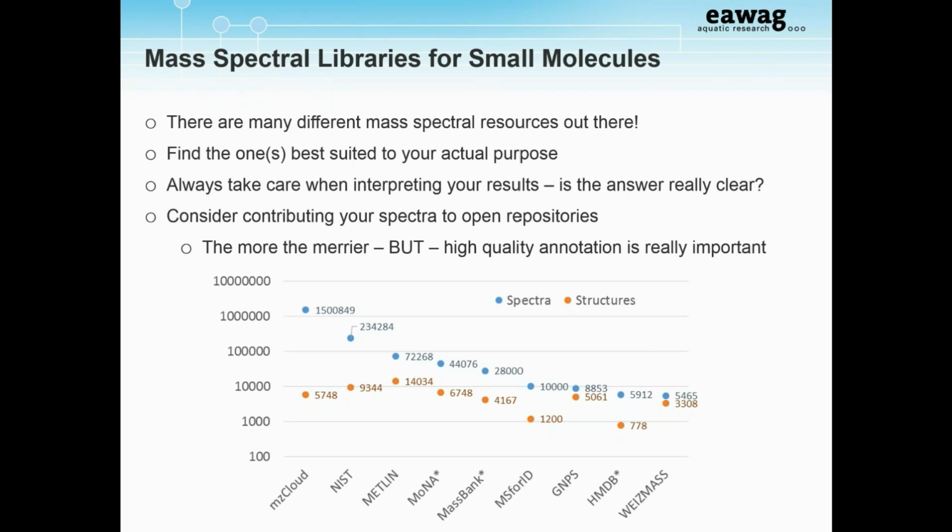The best way to do that is to put your thinking caps on and have a look at it. Just sitting back and having a look, so I showed already the example with this dimethyl-aniline. It's quite clear to anyone with a reasonable chemical knowledge that the different isomers would have very similar spectra. There are some cases where the isomers actually have very distinct spectra. This will be the same with alkenes. NIST has a very good alkane or alkene database, and it can actually tell you with reasonable confidence which one does match. But if you would think about it a bit more, you could see there are branching possibilities that may or may not influence.